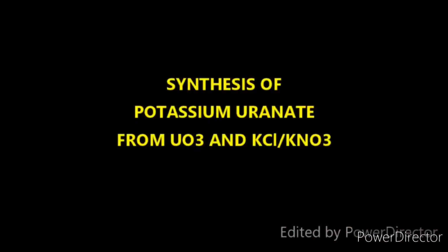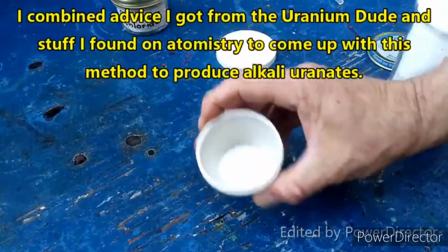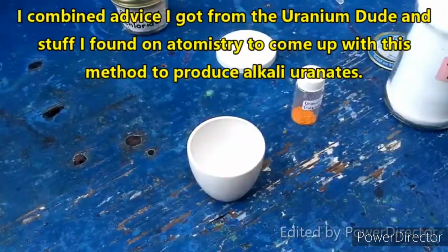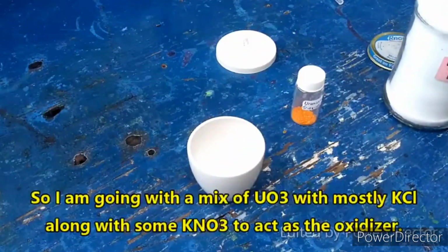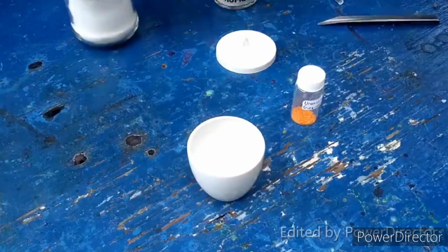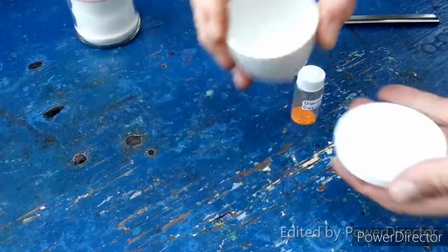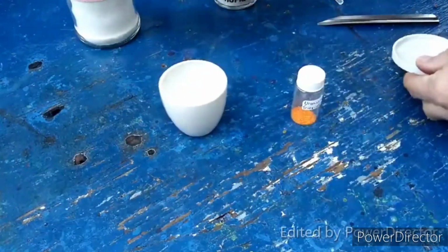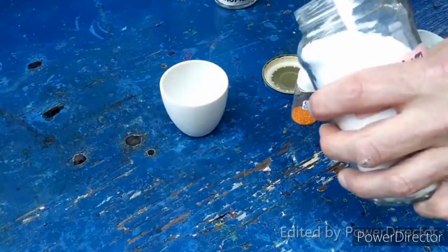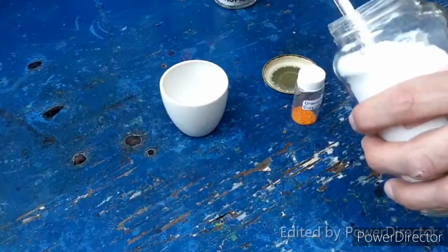So I'm going for a pretty decent excess of potassium chloride. I don't want to go too far overboard because I'd really like for it all to actually melt. I guess what I'm going to do to try to make this all work is, I know what I'm going to do. Alright, go ahead and add some potassium nitrate to this potassium chloride.